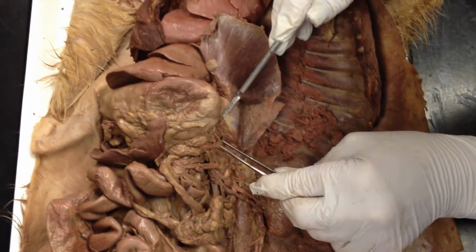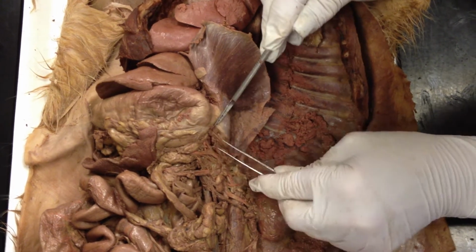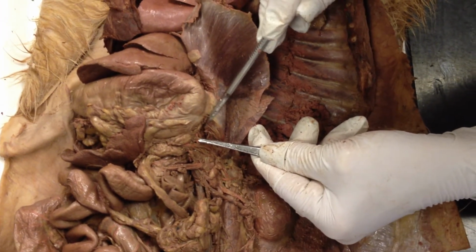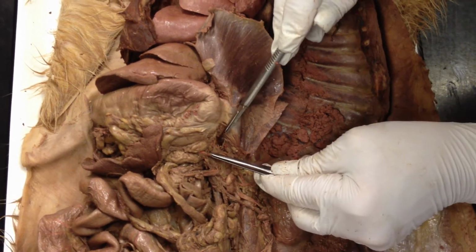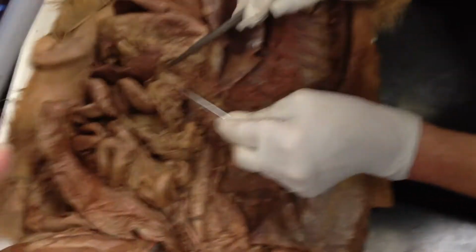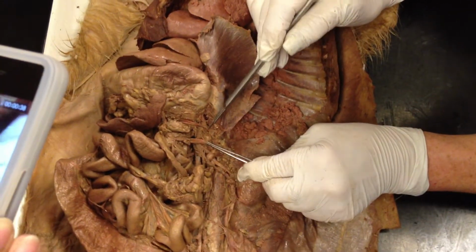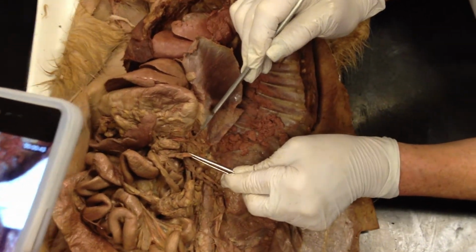Liver. Oops, sorry about that. The liver's a big one. So the liver is here. Hepatic is liver, right there. This is gastric. This is splenic. So liver, stomach, spleen. And you can see spleen once we get that separated a little bit. Now, the next one that's also unpaired is going to be the superior mesenteric right there.